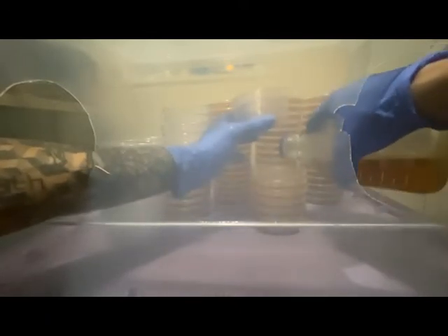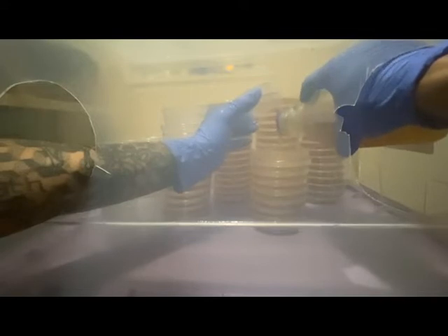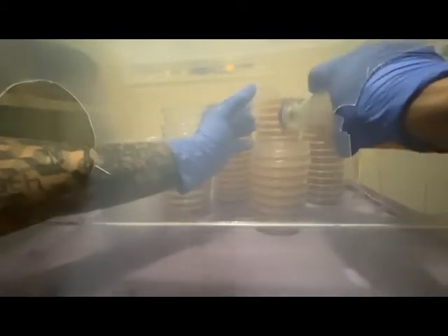Like I was saying before, you just want to go quick as possible. You're trying to beat the time. You're trying to hurry up before all your media bottles solidify. You're trying to reduce the risks of any sorts of contamination.